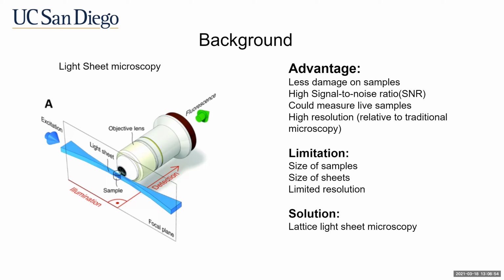However, the light sheet is limited by the diffraction limit of light and struggles to image samples which are smaller. In 2014, the latest light sheet microscope became capable of imaging biological systems spanning four orders of magnitude in space and time. The technique has a much thinner light sheet. Smaller samples can be imaged at high resolution.